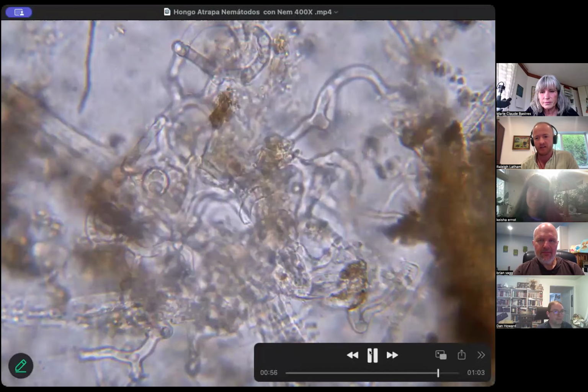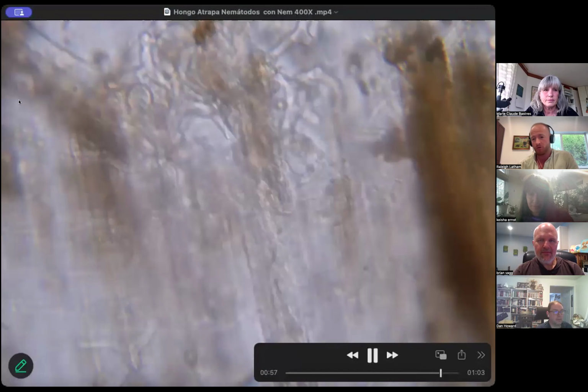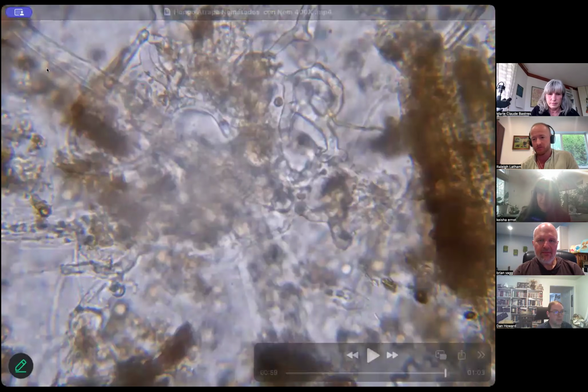We can show you things like that, especially if you want to record microscope views. It's a really good resource to get good video of what you're seeing under the microscope and share it around. I imagine if you're working with clients, they'd want to see really good sample footage too.